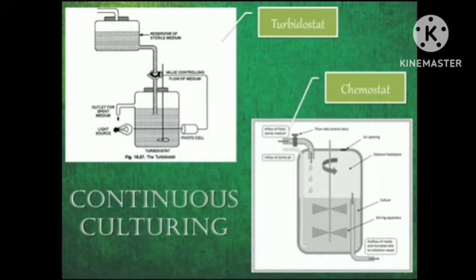And this is the left diagram, the turbidostat. How it works: controlled by cell density and turbidity. A photocell measures how turbid the culture is. When cell density gets too high, a valve opens, fresh sterile medium flows in, and excess culture flows out. The components: a reservoir of sterile medium, a culture vessel with stirrer, and a light source and photocell to sense turbidity.